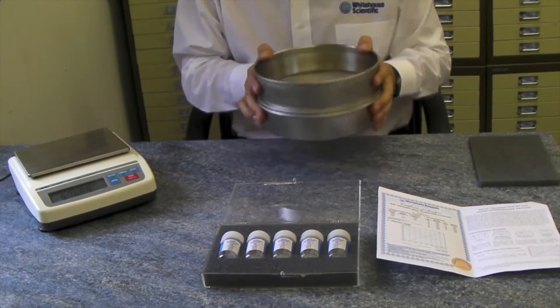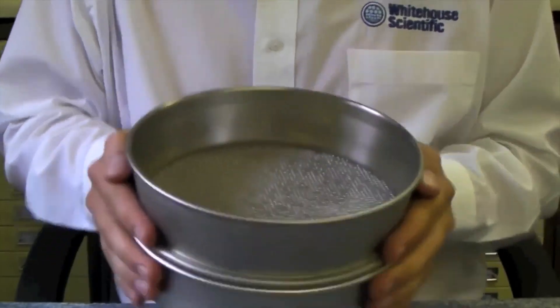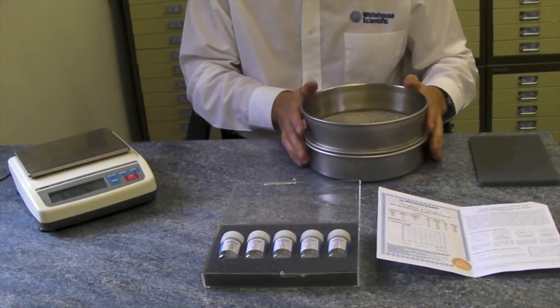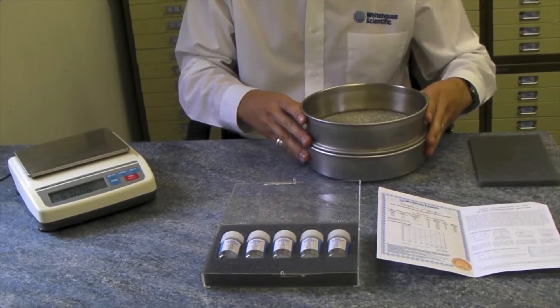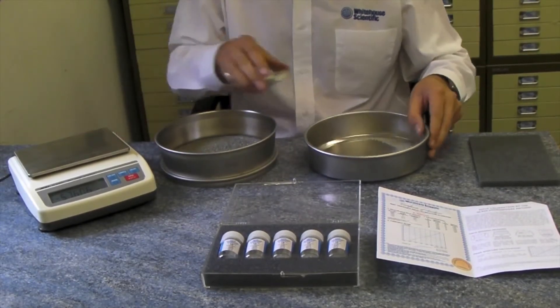Shake the sieve for one minute. This can be done by hand, as you see here, or by any other mechanical or sonic method. Once complete, discard the microspheres which have passed through the sieve.